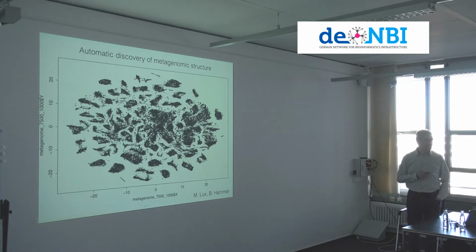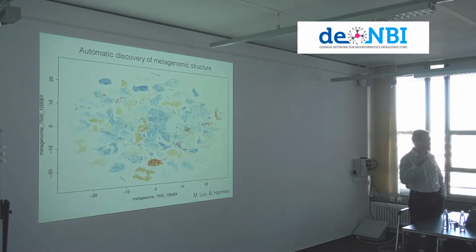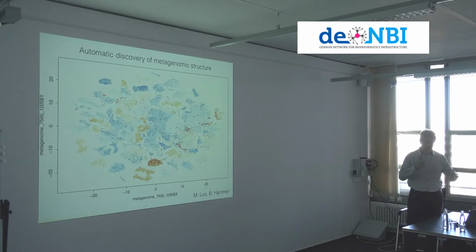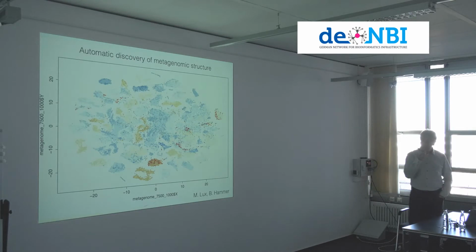Unfortunately, when you look closer, it doesn't really work because some genomes are really similar to each other, right? Just as the buildings I've shown before. And what you see now is the different colors here meaning different genomes, basically, and the different genomes are clustering in the same cluster. Right? But how can you split these into 2 or 3 different genomes here?